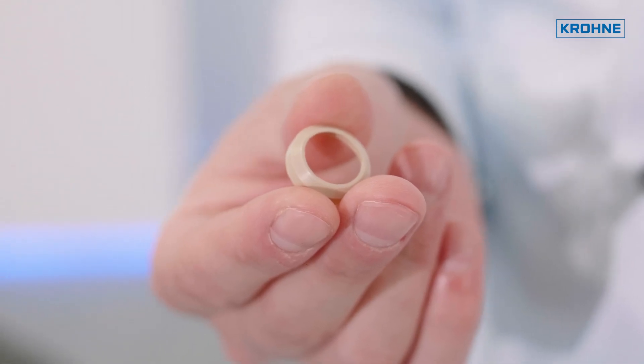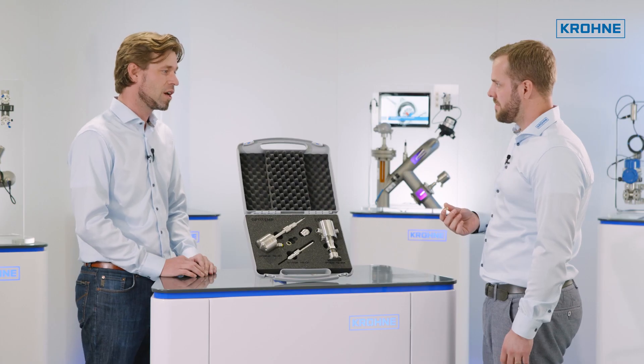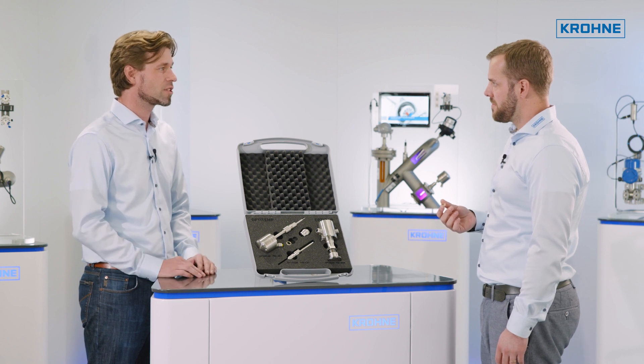It's a PEEK gasket because with the new EH requirements it's not allowed to have steel to steel connections anymore. So the advantage is if you remove the sensor from the process for recalibration you just have to exchange the gasket and not the whole sensor anymore. This is really money in your pocket.